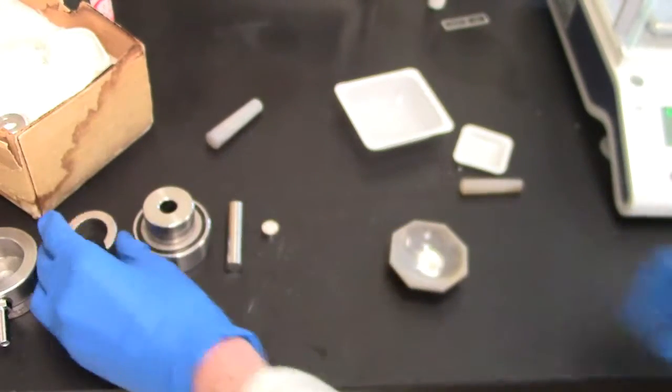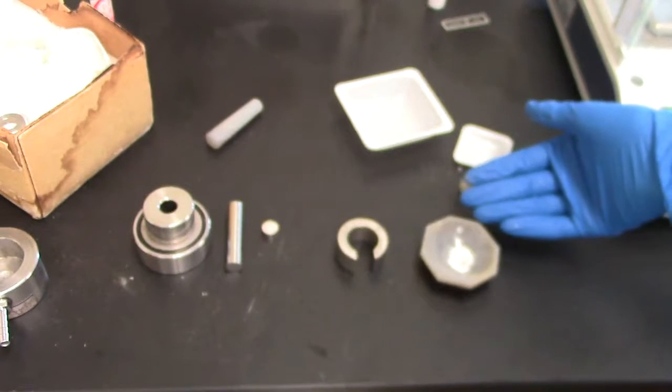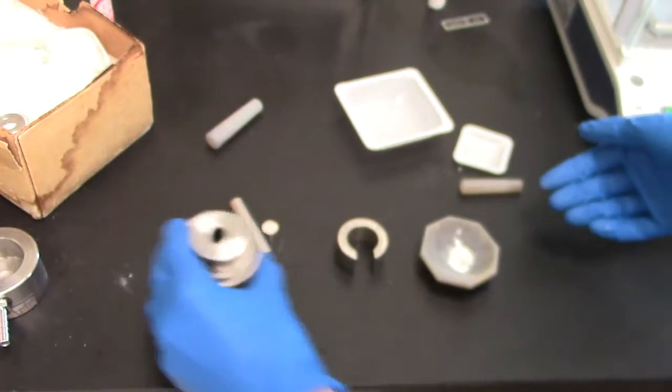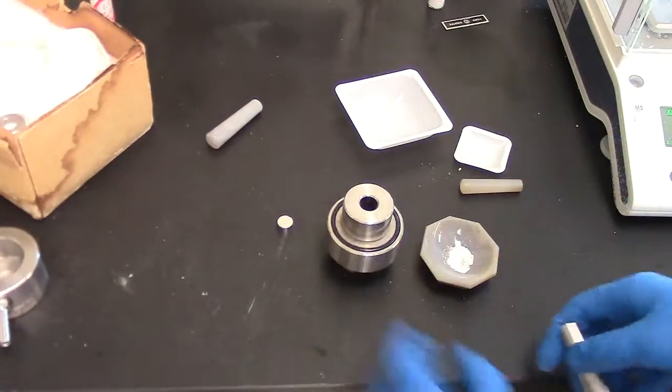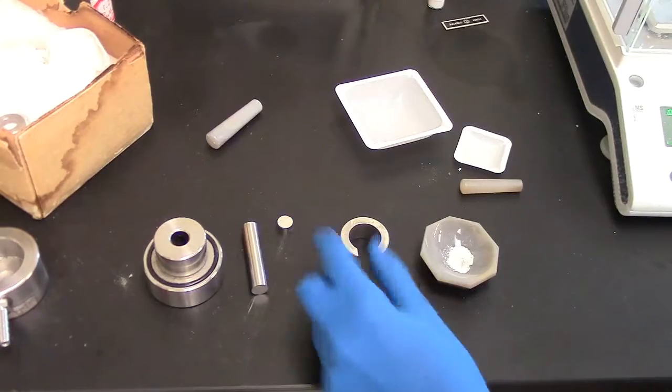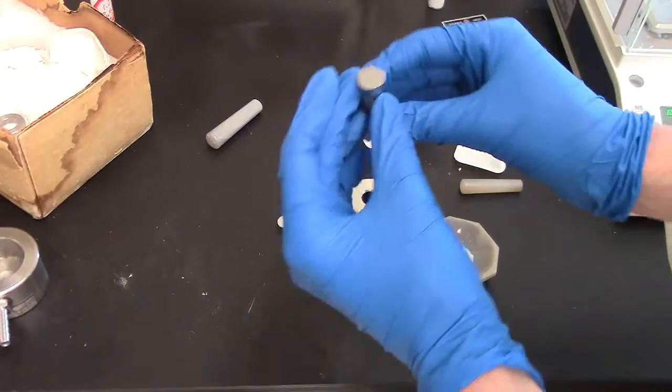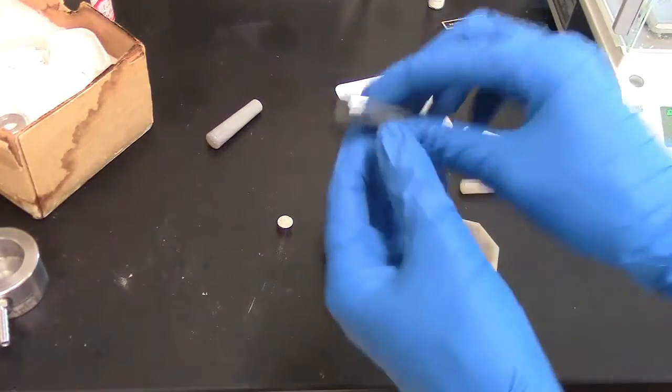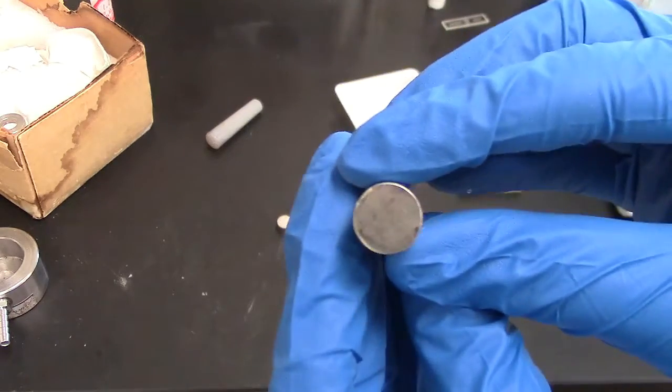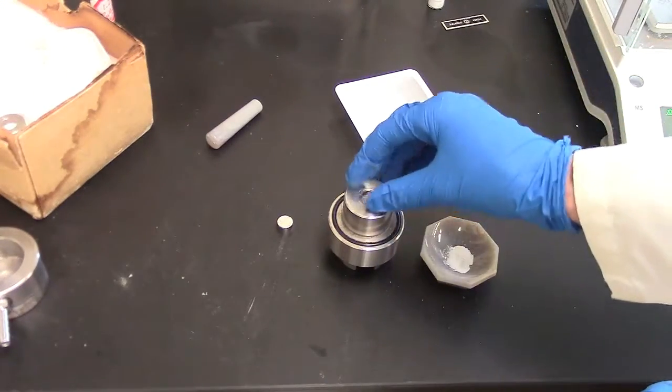Next, we want to put our ground-up substance and KBR into the press. You'll need all these different pieces here. So you first set down this part, then take this bigger part. There are two sides to this. There's a flat, shinier edge, and then there's a rough edge. You want the flat, shinier edge facing upwards.